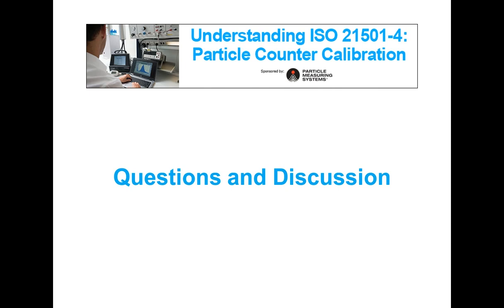Okay, now we have another question here. If my equipment is not calibrated and cannot be calibrated with this standard, will it affect our particle counts? That's an interesting question, Mike. It's out of any doubt that the technology about particle counter detection has improved during the last years.